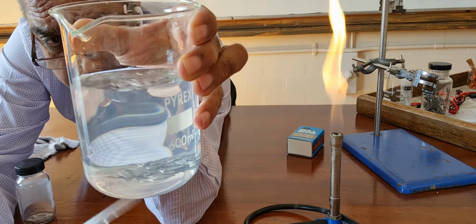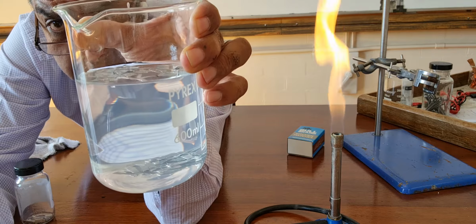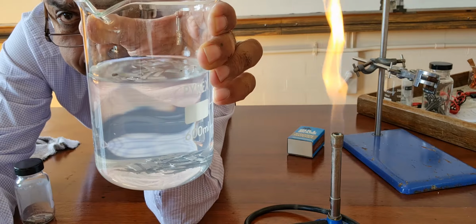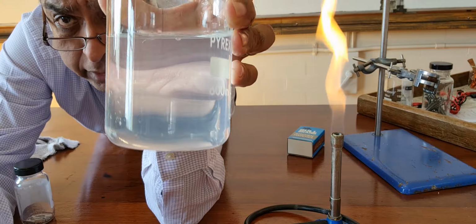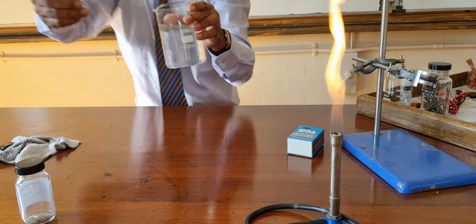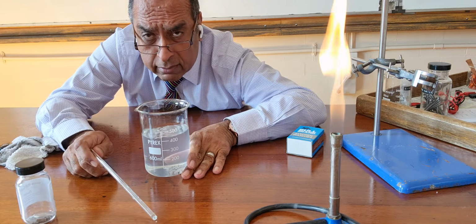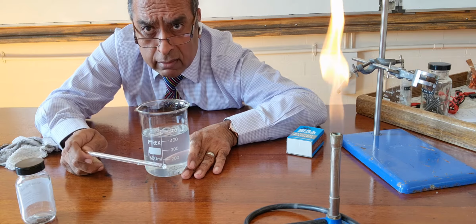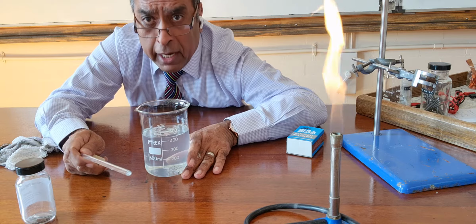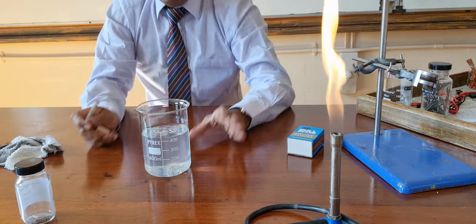When we're looking for these reactions, we're looking for bubbles. Can you see any bubbles? The bubbles will be bubbles of hydrogen gas. And I can't see any. So does that mean there's no reaction? Maybe. But it could also mean that the reaction is very, very slow. So I'd like to do a little experiment.